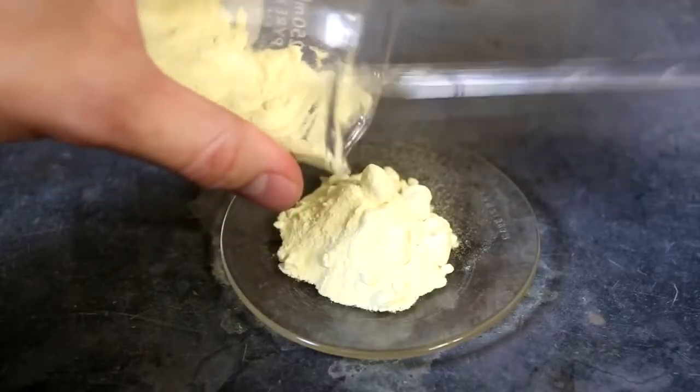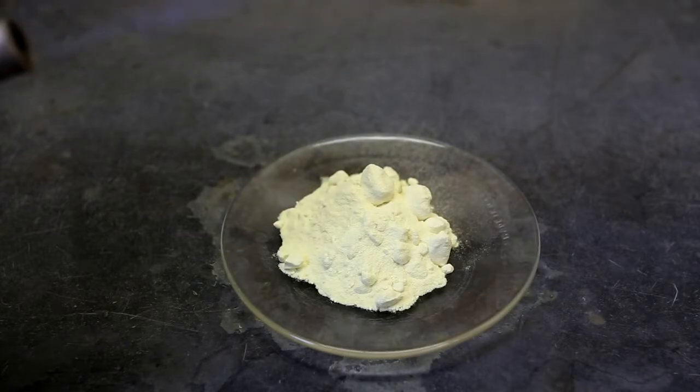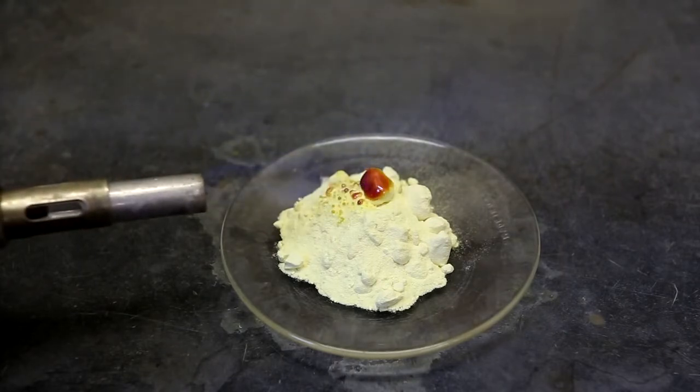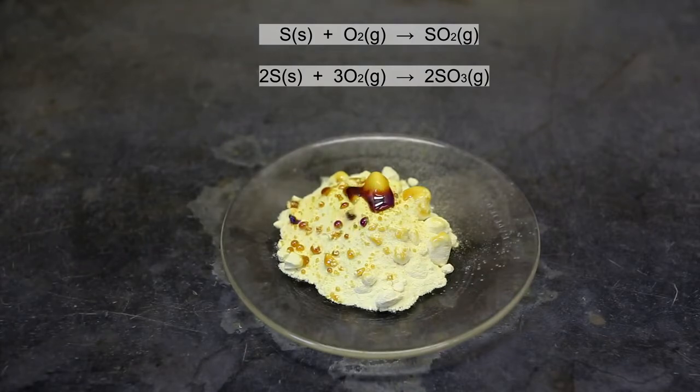First, some sulfur is placed onto a watch glass. Next, a little bit of the sulfur is ignited using a Bunsen burner. When the flame touches the sulfur, it immediately melts into a blood red goop. When the sulfur is ignited, it starts reacting with oxygen in the air to form sulfur dioxide as well as sulfur trioxide.